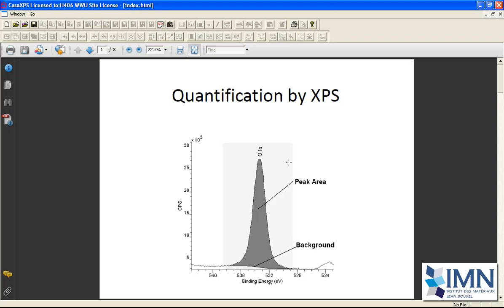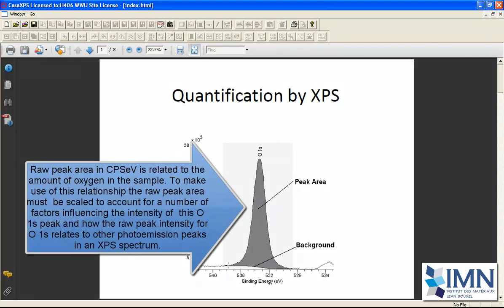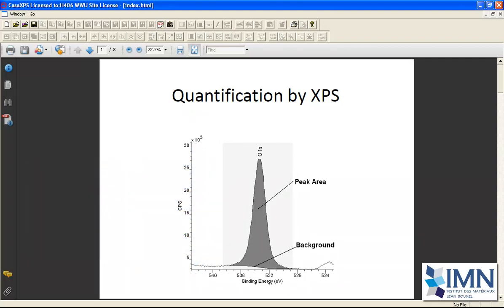In this case, we've got an oxygen 1s peak. And to measure the amount of substance in terms of oxygen, we have to define a background. The background is related to the process of photoemission in a solid state. We have a peak shape that we have to integrate in counts per second eV. This will give us a measure of how much oxygen is in our sample. However, there are a number of factors involved that determine the intensity of this peak for a given amount of substance.